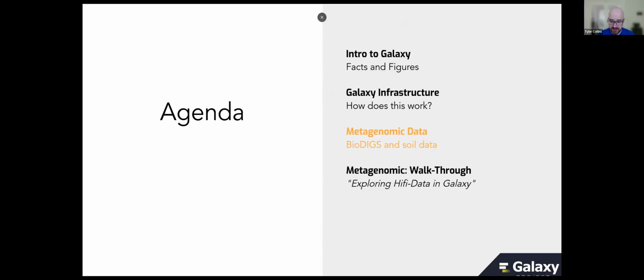All right, guys, I'll take over for the next part. My name's Tyler Collins. I'm a member of Mike's lab, and I will be going over two parts. The first is going to be a high-level overlook of the metagenomic data we're going to be working with today, the project it originates from, and then the subsample data from a specific site that we'll be using. And it'll be a nice collection of metagenomic soil data generated from PacBio HiFi sequencing.